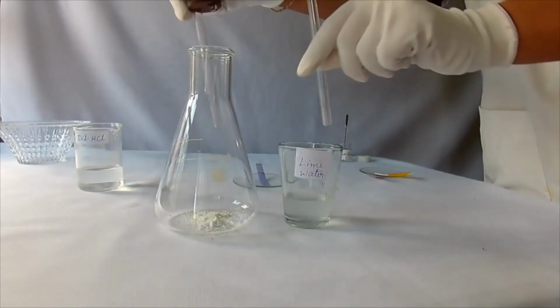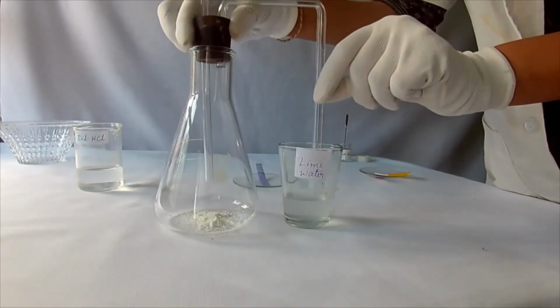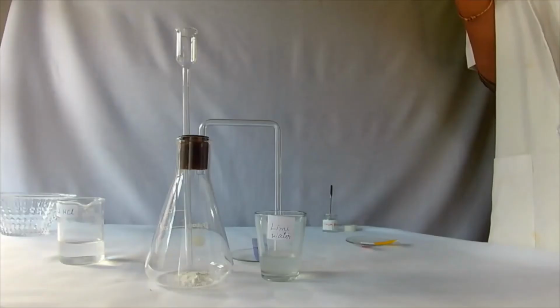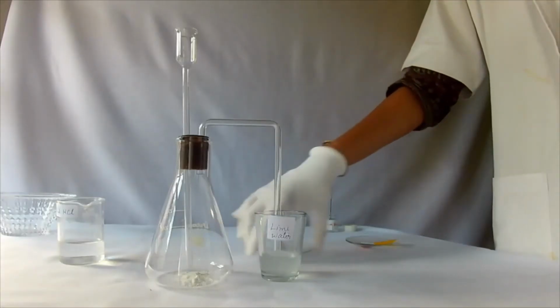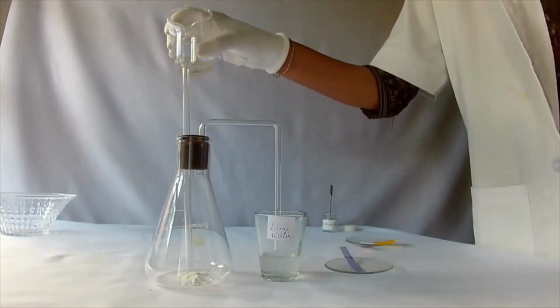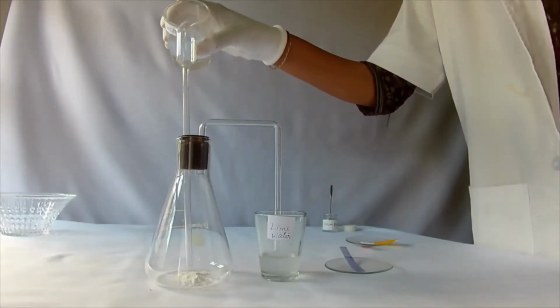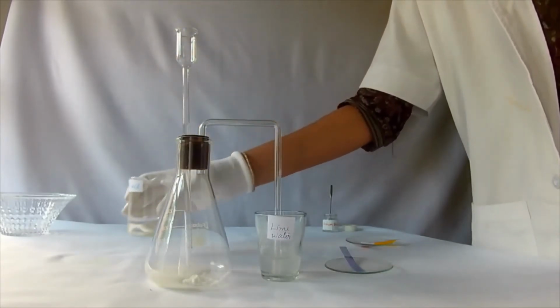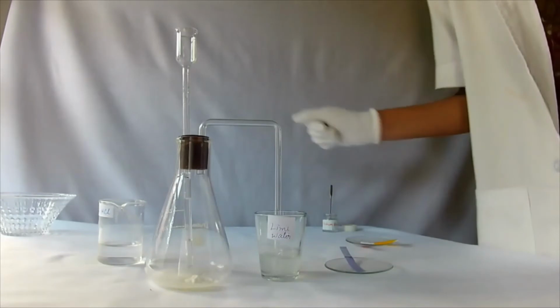Fit the cork carefully onto the conical flask. Add dilute hydrochloric acid into the conical flask through the thistle funnel. Carbon dioxide gas is evolved.